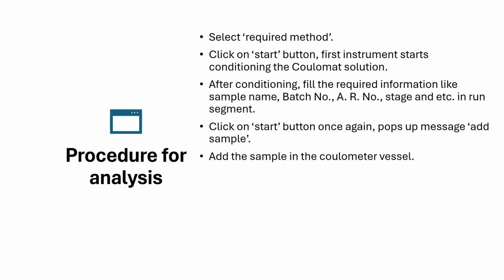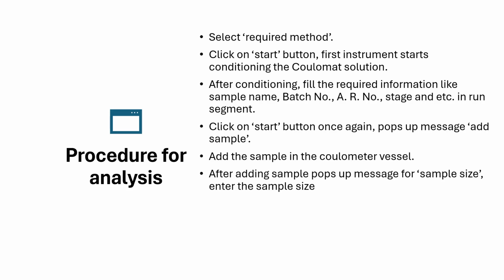When this message appears, add the sample into the coulometer vessel after weighing. After adding the sample, there will be another pop-up message for sample size. You need to enter that sample size, that is, whatever amount of sample you have weighed, the weighing reading needs to be entered accurately in this pop-up message.